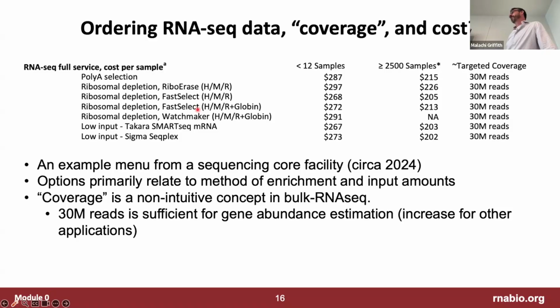People aren't really generally doing that. The flow cells are consistent enough that the sequencing core has their own strategy for how they break things up, and they'll often blend things together in case there are weird biases in the sequencing libraries coming from one experiment versus another experiment. And the flow cells actually perform best when there's a real diversity of molecules and their ACGT content. But they'll handle that, and they have controls that they include on every run to watch out for any problems, and they'll generally offer certain guarantees of data quality and consistency that you don't really need to worry about. Yeah.